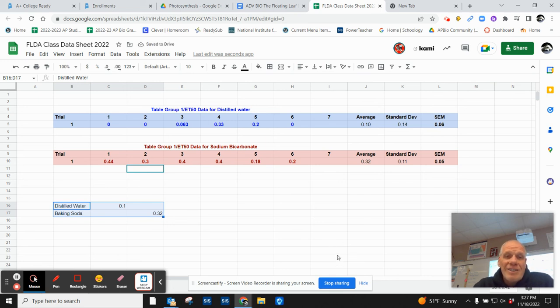And remember, you have to design an experiment now. You do have to design an experiment that looks at a different variable. Okay, so look at your notes. We can vary the wavelength of light. We could vary potentially the sodium bicarbonate percentages. We could vary the plant species that we're using.